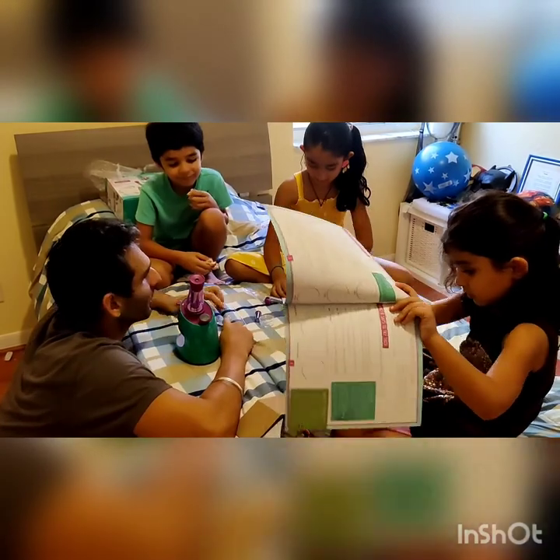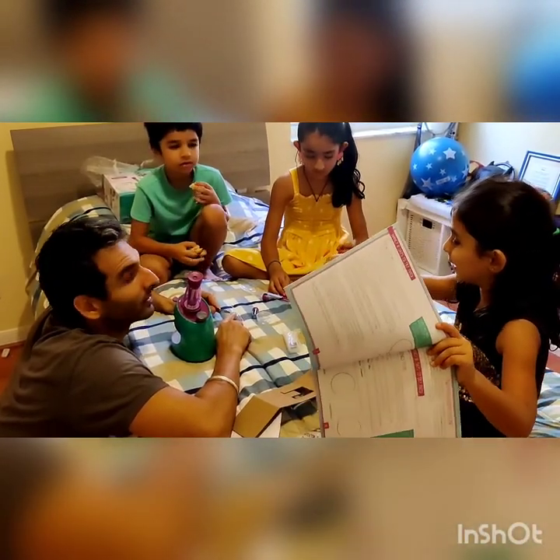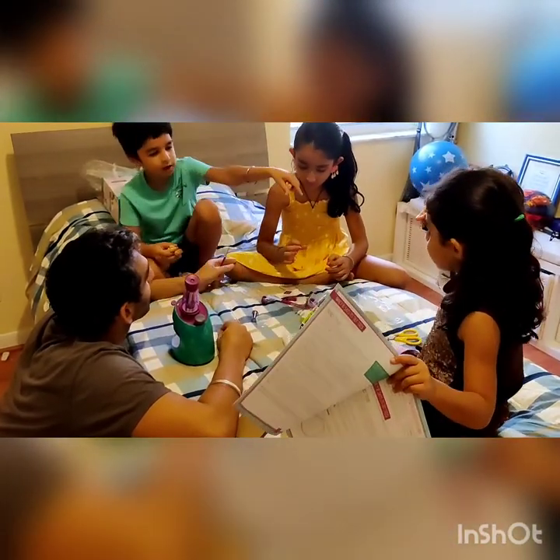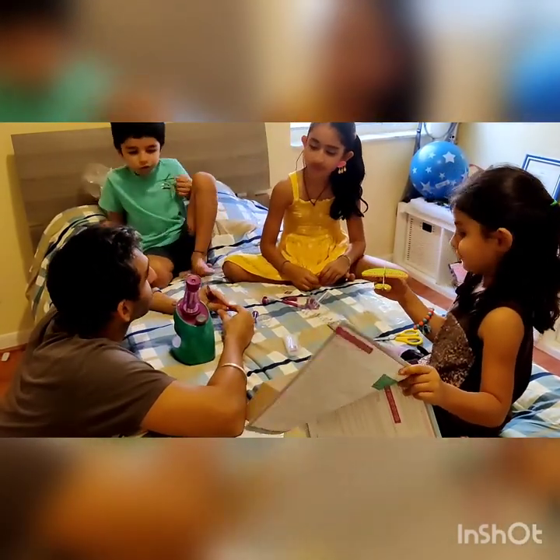How do I say it? Like your skin, you can tease your skin over here a little bit, that thin. Like a small thin paper that onion cuts, the onion peel. So you take that small piece of onion and put it on the slide.